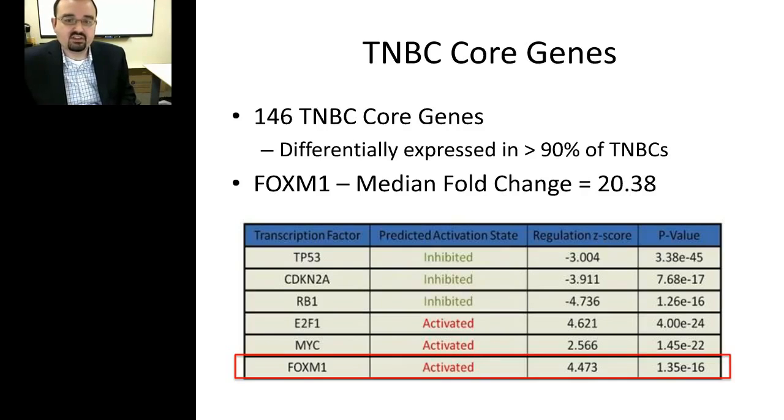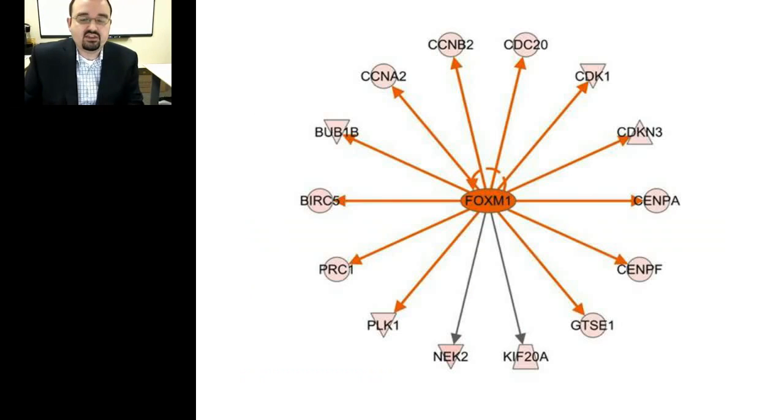As I mentioned before, we see, again, a wide range of the number of genes that are differentially expressed and mediate this chaos, from 1,300 to 3,500 genes. And interestingly, this represents about 14,000 genes in the genome. As you can imagine, there are roughly 20,000 expressed protein-coding genes in the human genome, and this transcriptional chaos analysis encompassed roughly 14,000 of those.